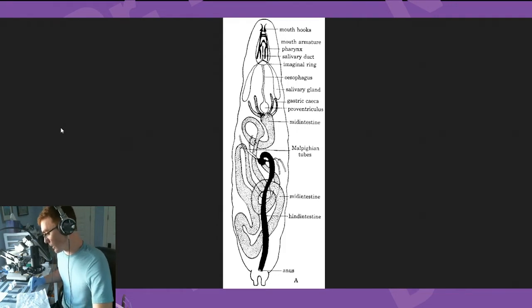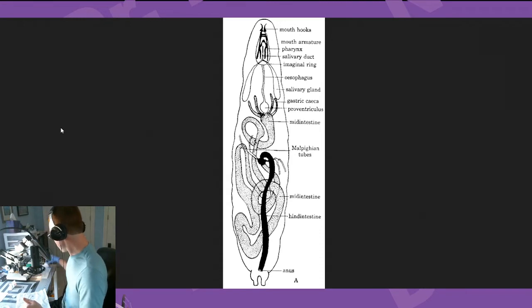These specific tissues in fruit flies are really, really interesting because they're what we call polyploid or polytene. That just means instead of 2 copies, they have hundreds or even thousands. And so because of that, we can actually see it under the microscope because they line up next to each other, making these really, really big, thick strands. Now, I don't actually know if I can do this with this microscope, but I'm going to try.